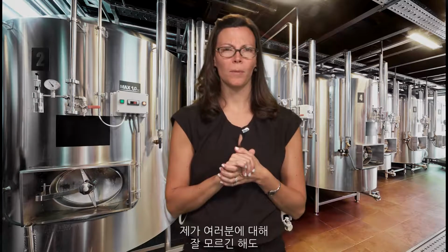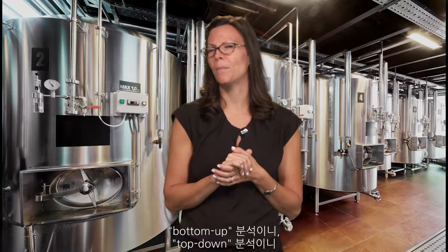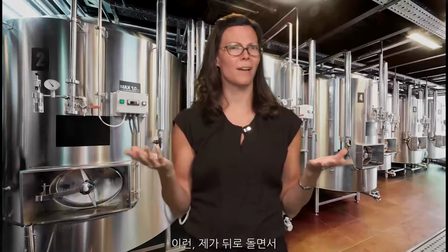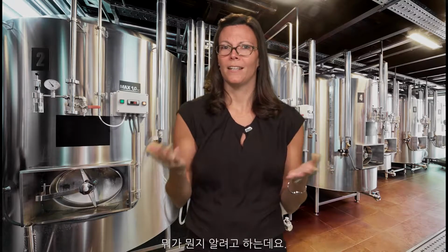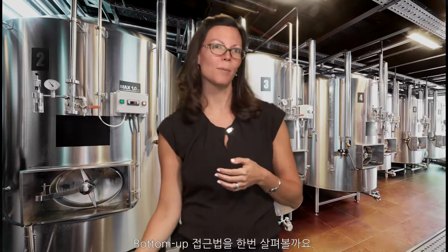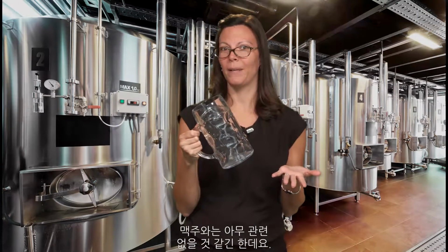I don't know about you, but when I read about protein quantification, I always hear all these terms: bottom-up analysis, top-down, middle-up, middle-down. Boy, do I get turned around trying to figure out which is which. So in this episode of Behind the Science, let's take a look at the bottoms-up approach for protein quantification. I have a feeling it has nothing to do with beer, but I can always be hopeful.